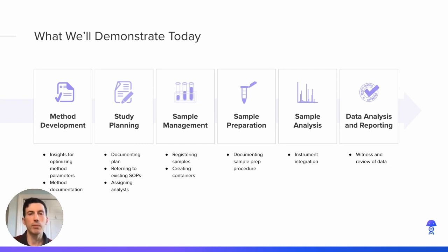So for the live demo here, I'll be touching on some key aspects of each one of these different activities and the processes within them. For method development, looking at how one might capture some of those methods and gain some insights from them, through study planning and establishment of those SOPs, and then through the sample testing flow. So sample management, prep, data analysis, and then finally witnessing and reviewing of that data collection.